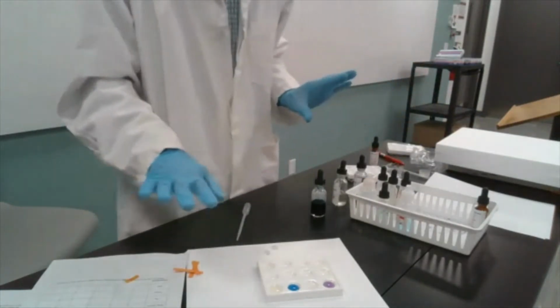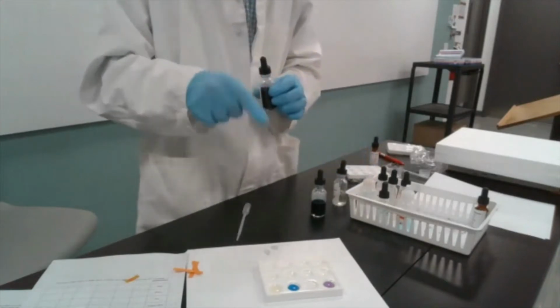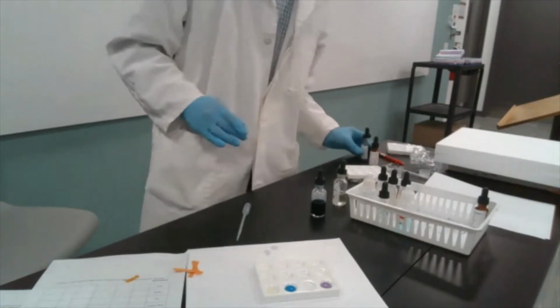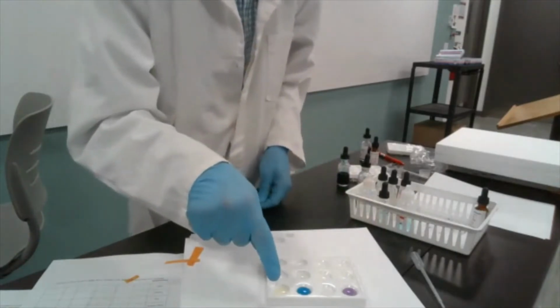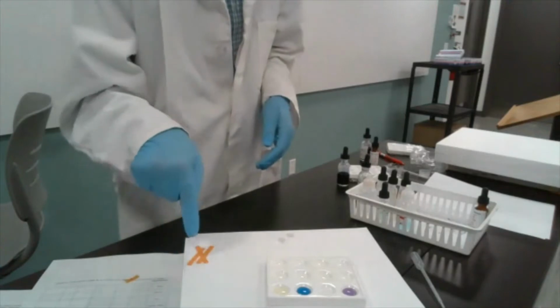Let's do the same thing, but now with sodium hydroxide. And watch as the color changes as I add these indicators. Let me see. So this is all distilled water. You can ignore the slight yellowish color here because that's where I dipped the indicator strip.